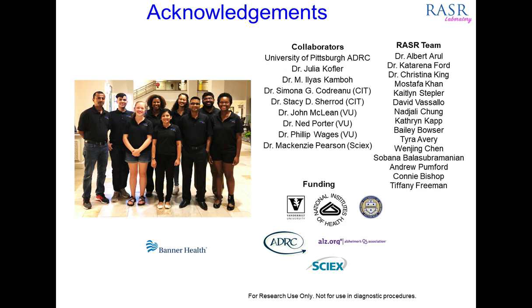So certainly we've observed that with better instruments in time, we've been able to get better quality data. I will say that I don't think that you necessarily have to have some of the best instruments to get quality data. I think it just requires more work on the front end and in the way that you do your data collection in order to get a comparable amount of information. But yeah, hopefully that answers the question. Definitely with better quality instruments, we get better data overall, whether that was with our proteomics workflow or with our lipidomics workflow as well.